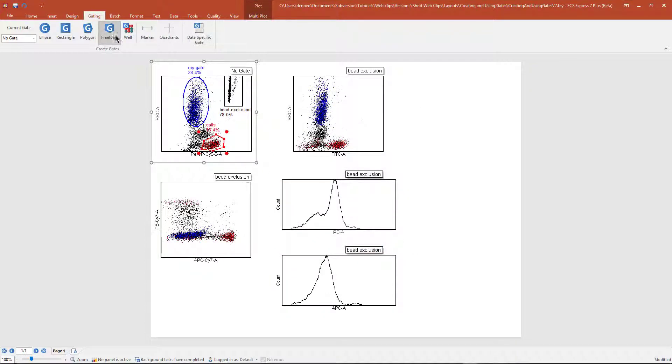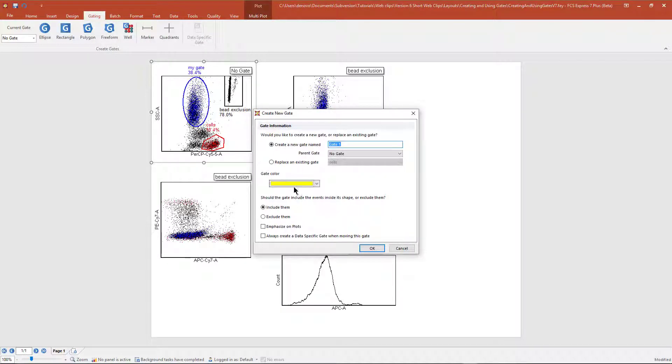The freeform gate is like a pencil tool. You can draw any type of shape you want.